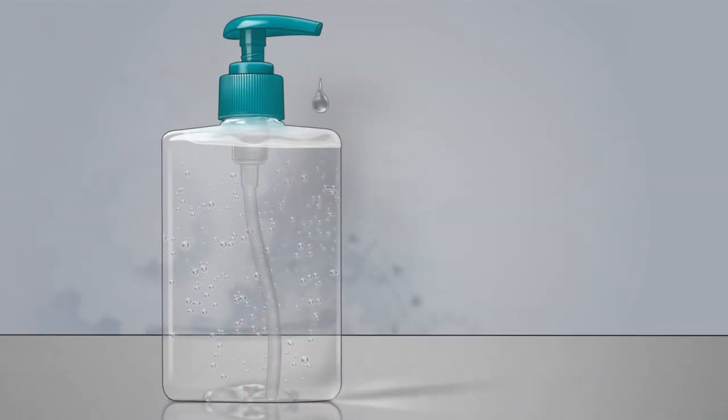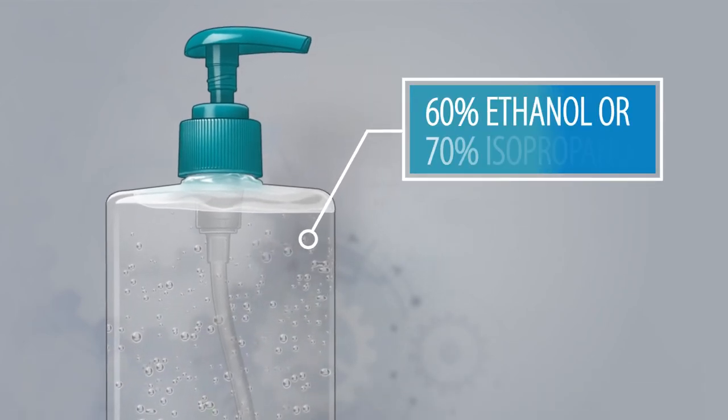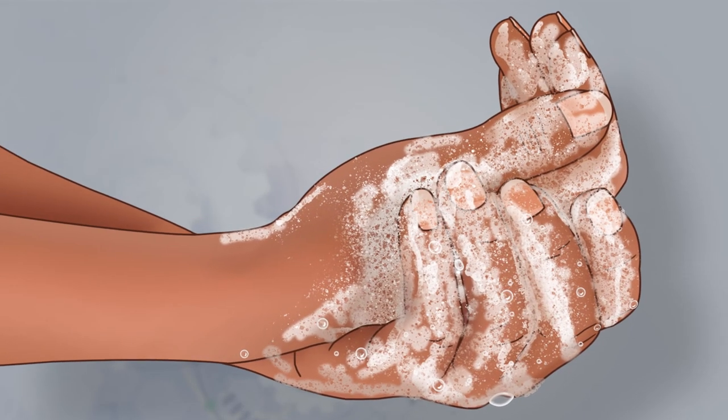Apply alcohol-based hand sanitizer with at least 60% ethanol or 70% isopropanol to your hands. Wash your hands with soap and water or don a new pair of gloves.